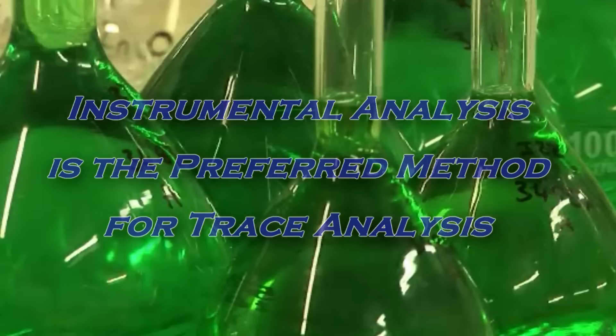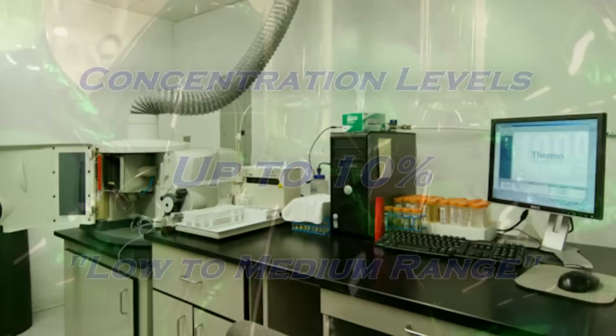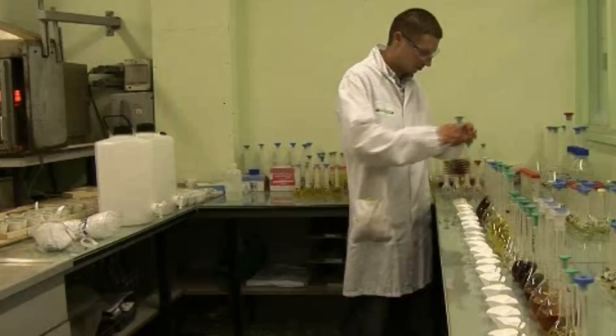The low to medium range, defined as up to 10% precious metal content, often uses instrumental analysis since results are often obtained faster. In the high range of 10% to 100%, chemical methods of analysis have superior precision over instrumental methods.